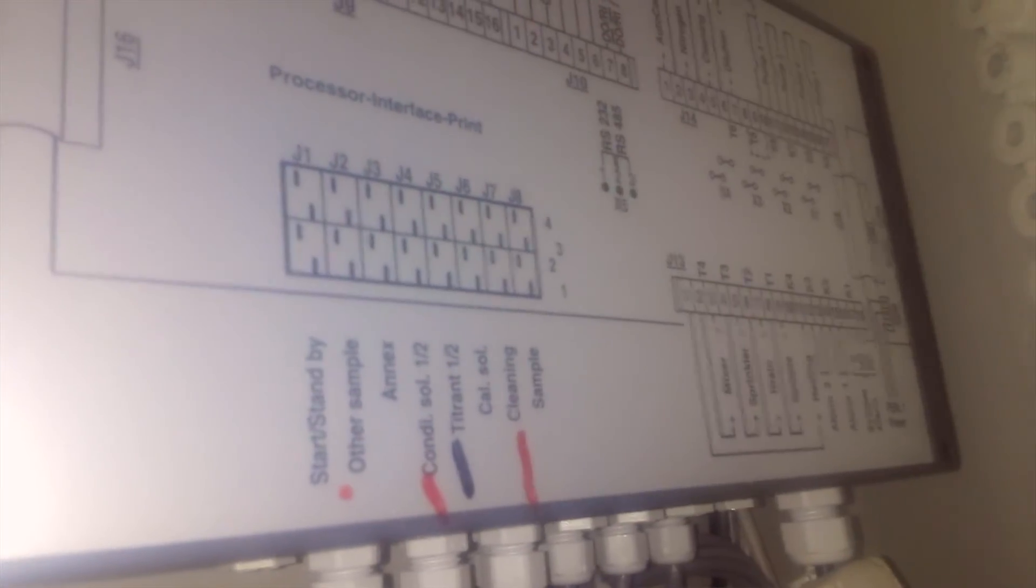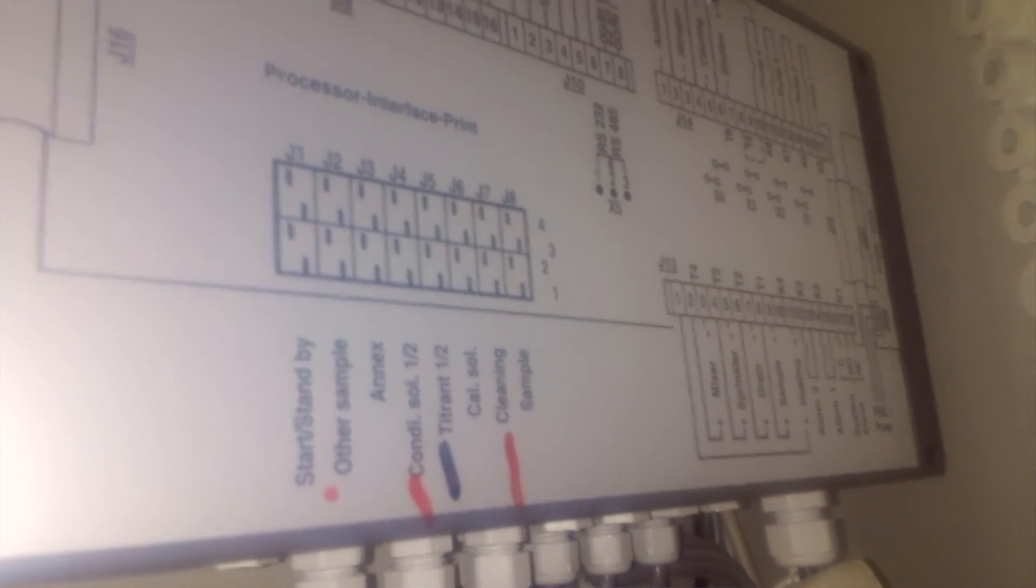This is the backside of the electronic controller. There is detail of different types of connections which shows you how you can connect different components of the analyzer and the output of the analyzer. This is the nameplate detail of the electronic controller.